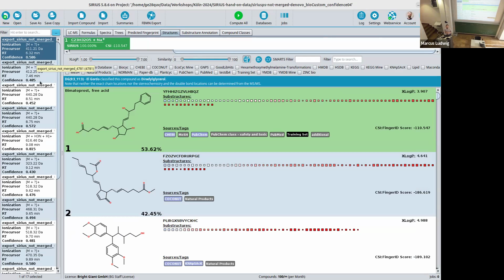For these specific tasks, if you already know it's a lipid or it's a peptide, there may be other methods that work better, because they're only looking at this specific class to optimize, basically. But the usual thing is that you don't have 100% lipids in your data set or only sugars. So it's good to have this generalist tool to first give you an idea.